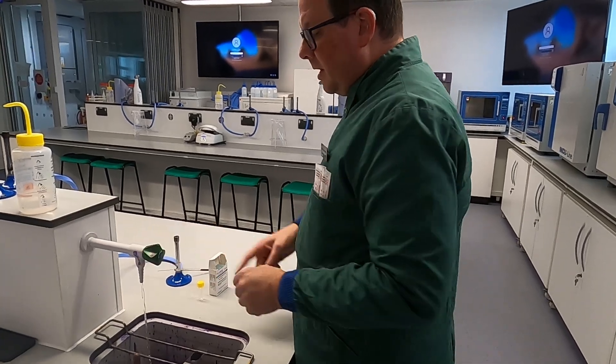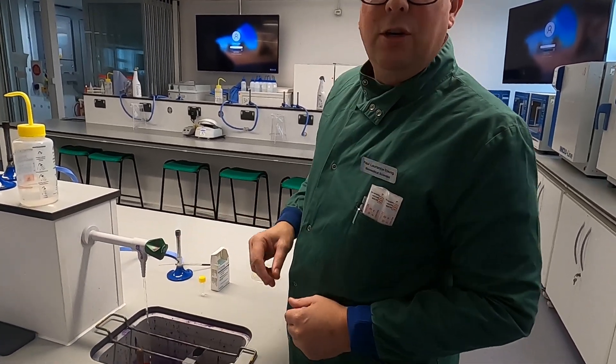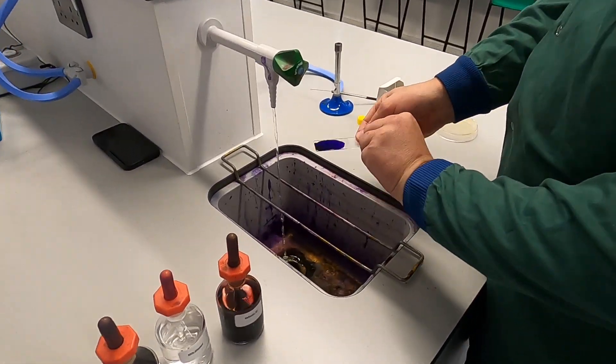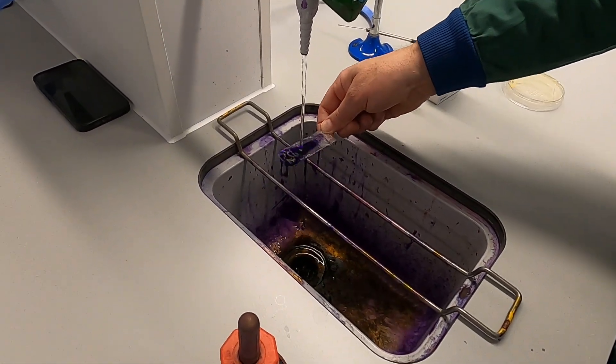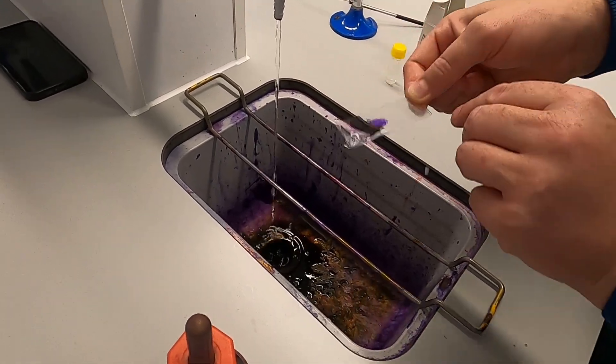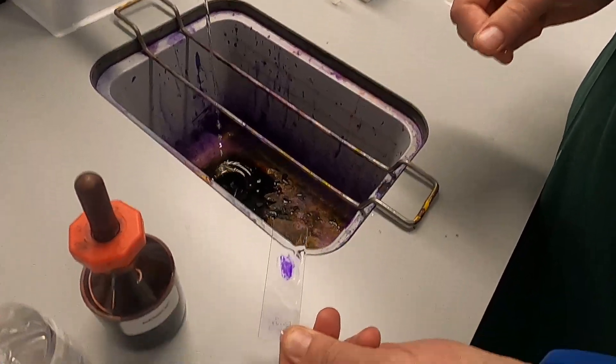Once it's been on there for a while, turn your tap on and get a good flow of water. Rinse it off, pour away, turn your slide upside down and wash. You'll see the bacteria are now bright purple.